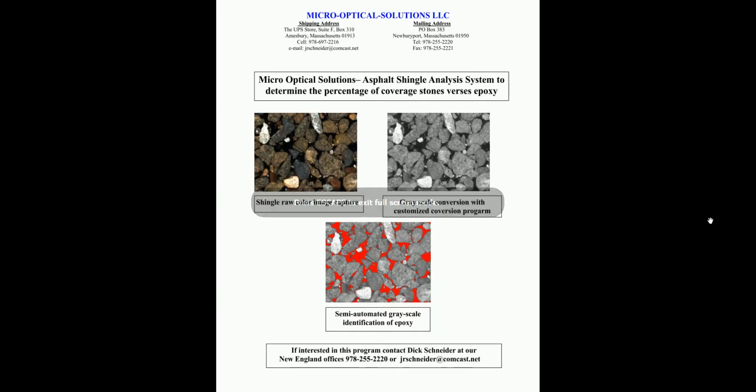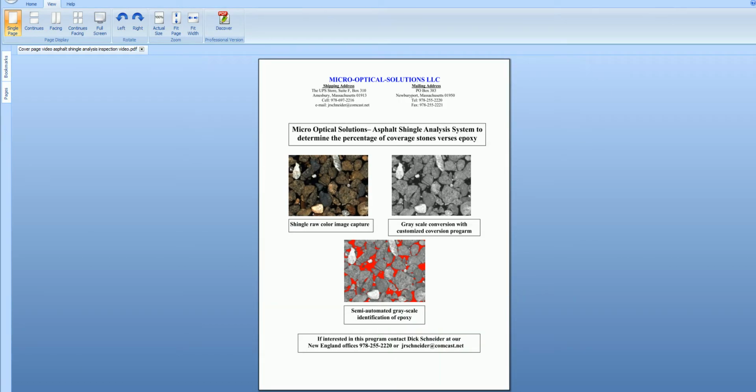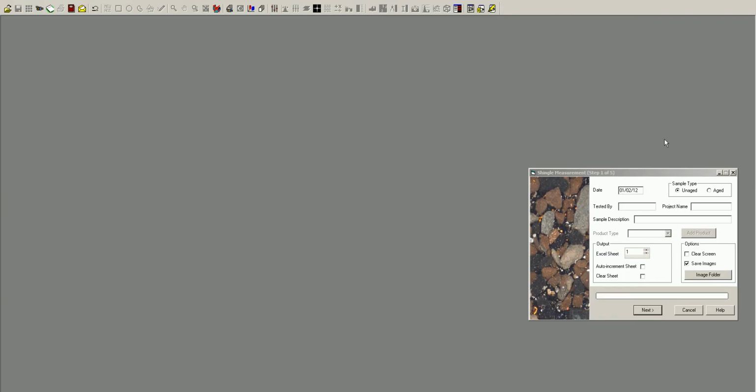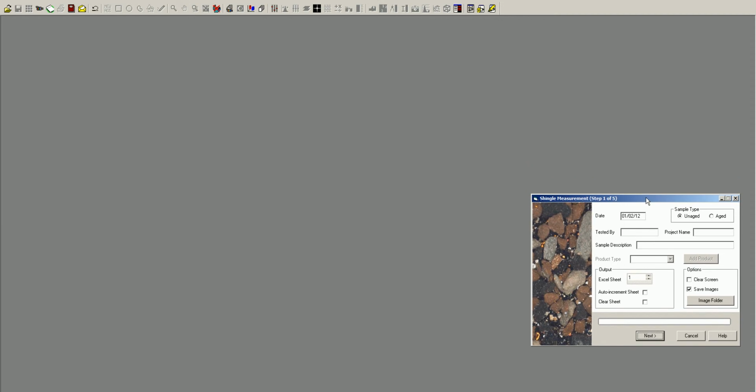The following video is designed by Micro-Optical Solutions for the analysis of asphalt shingles. The program will determine automatically the difference between the coverage of stones versus epoxy. I'm now going to open up the program, which is run in an Image-Pro Plus image analysis format.